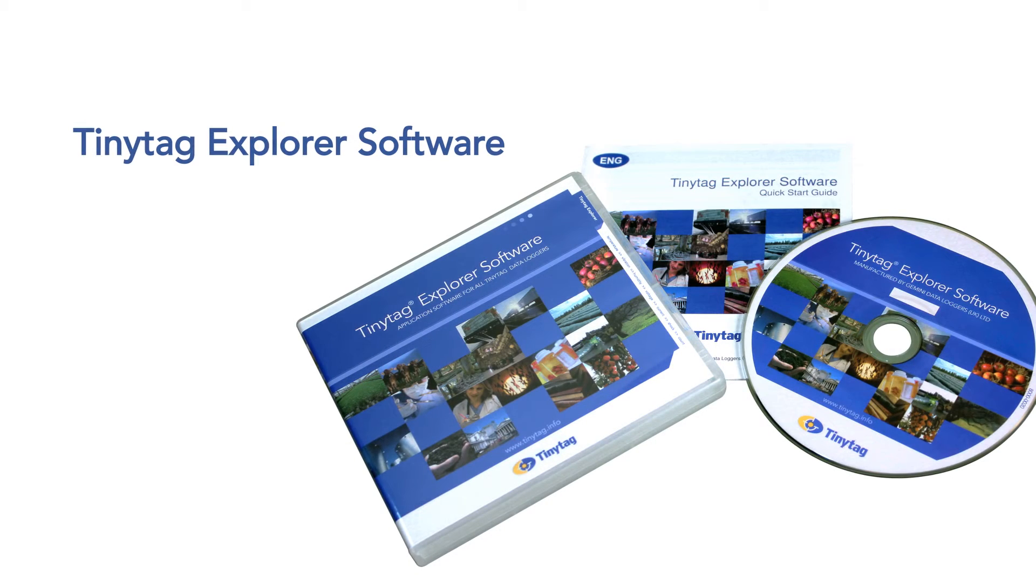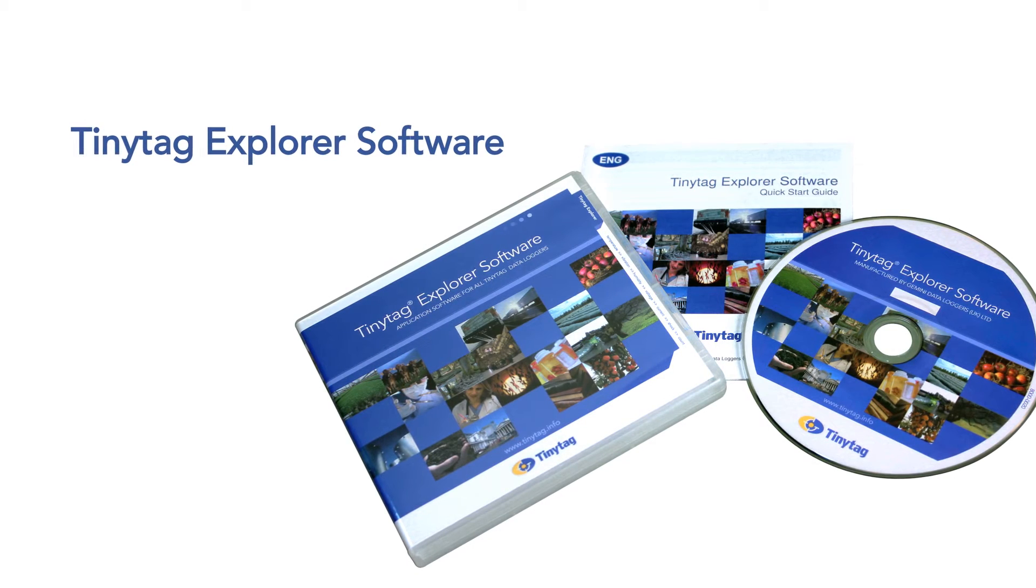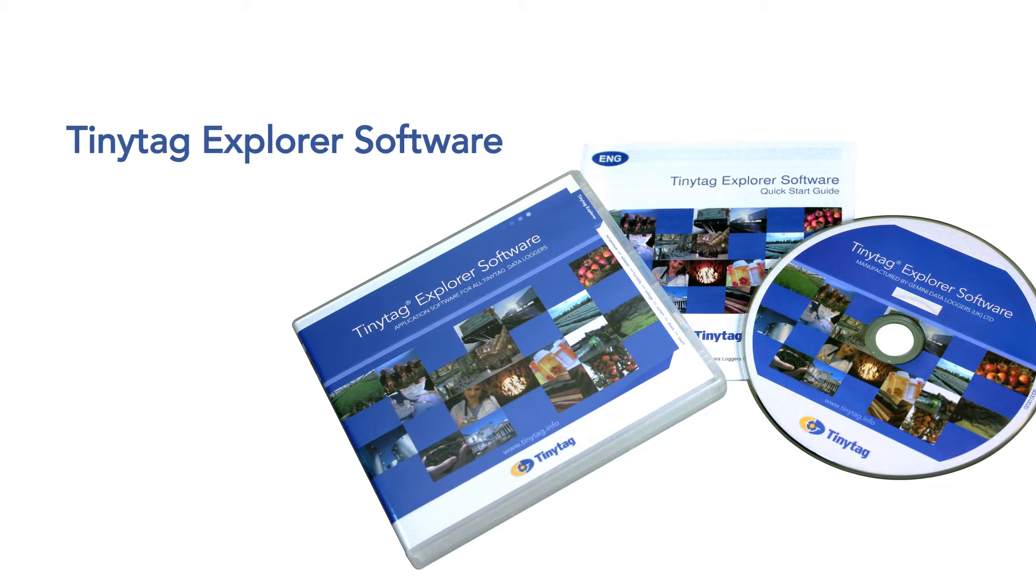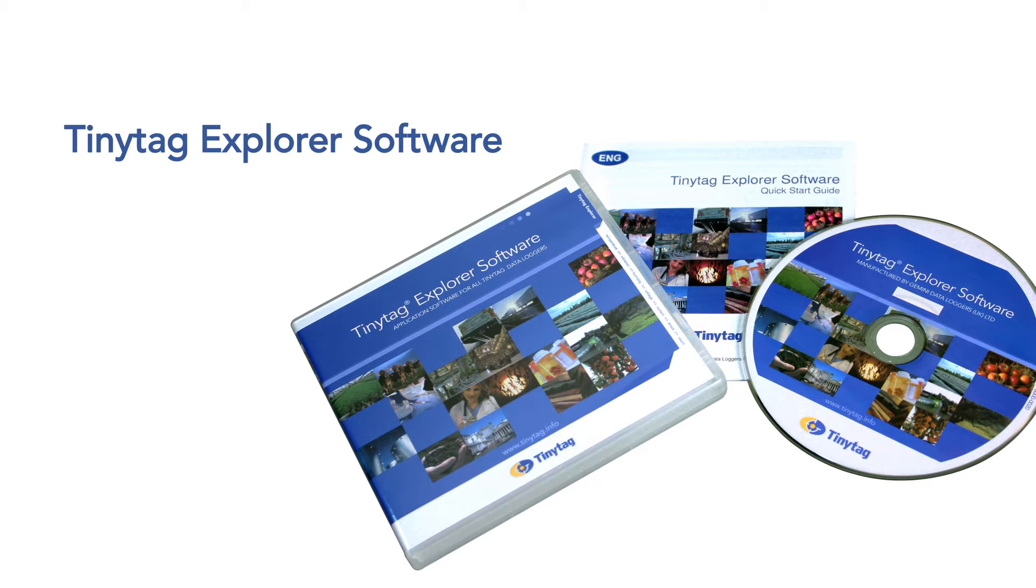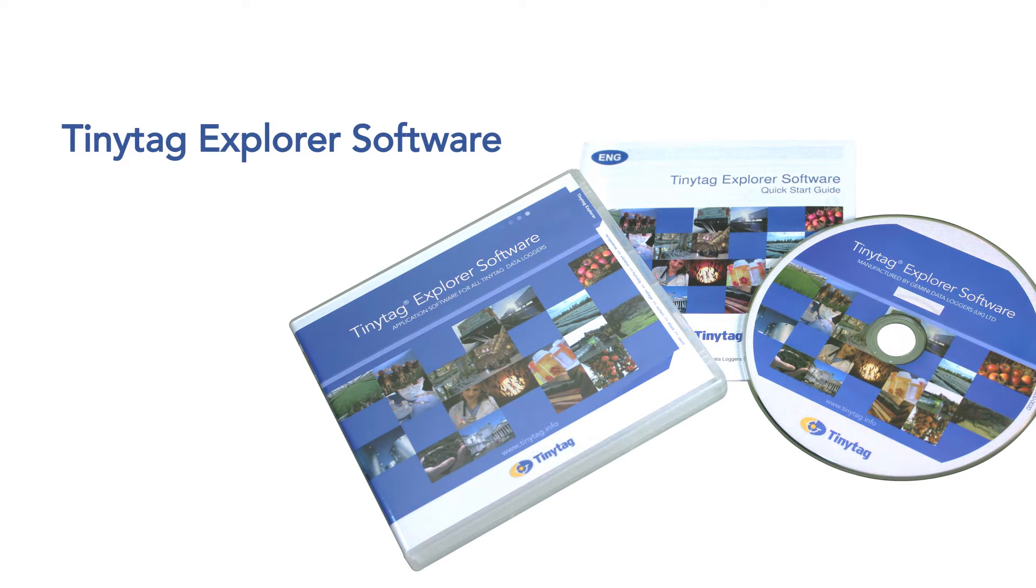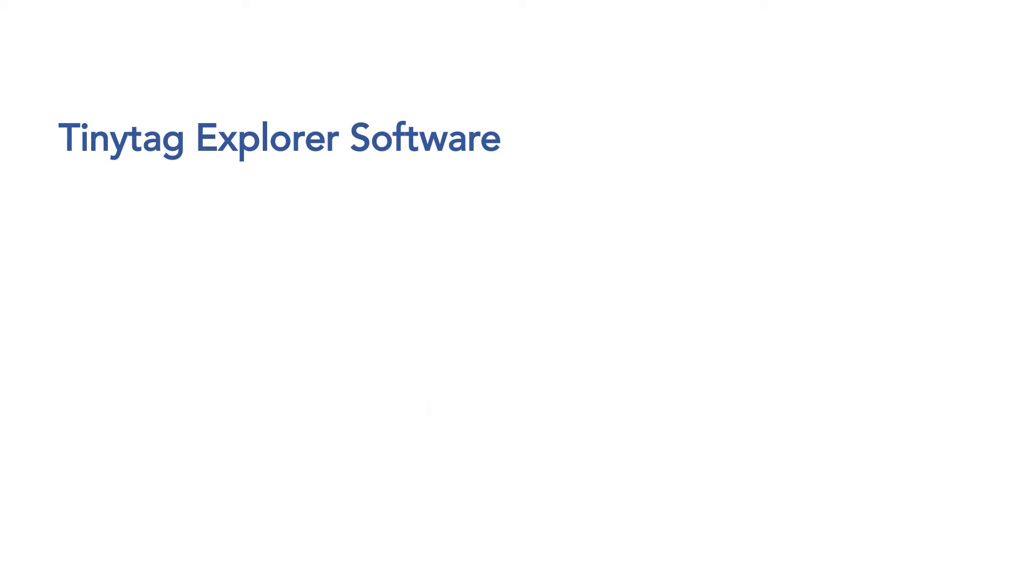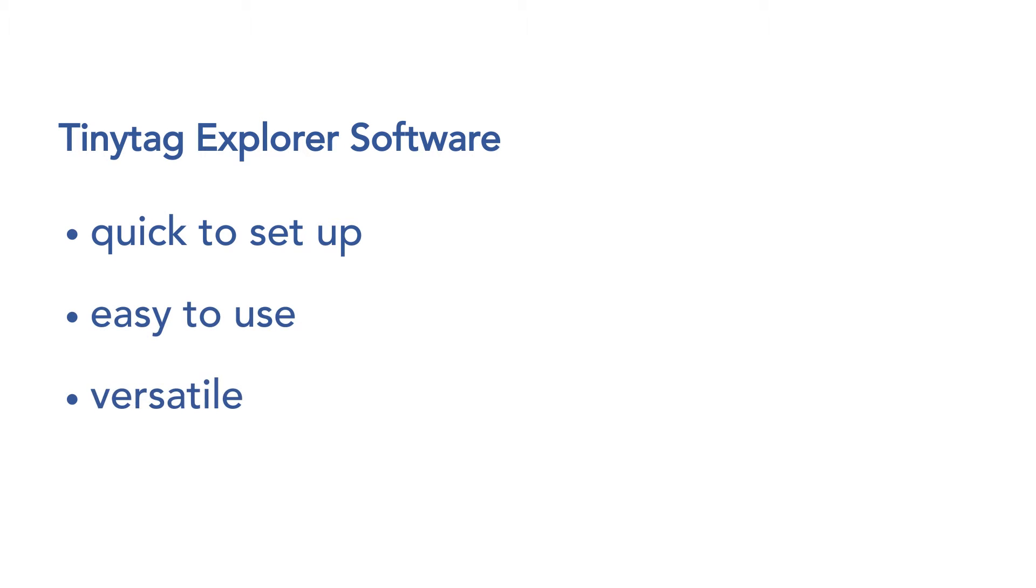TinyTag data loggers need TinyTag Explorer software, an easy-to-use Windows program to configure them and display recorded data. TinyTag Explorer is quick to set up, simple to use, and versatile in terms of how recorded data is presented.